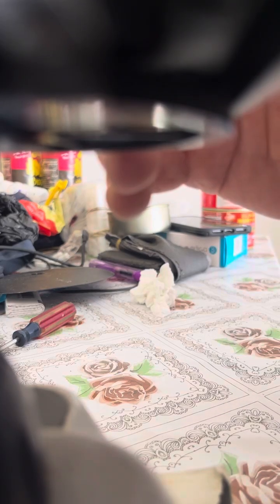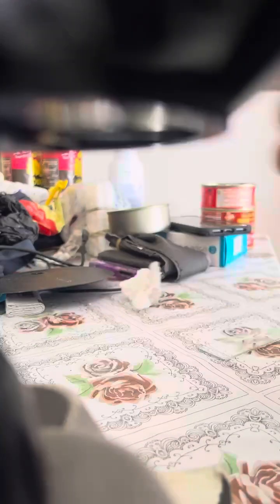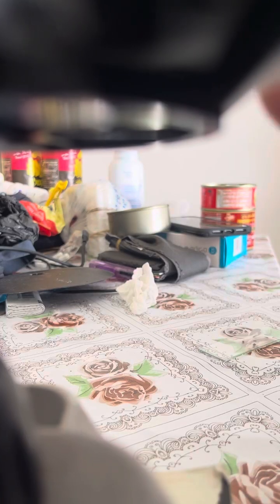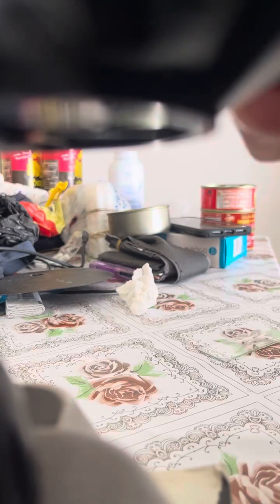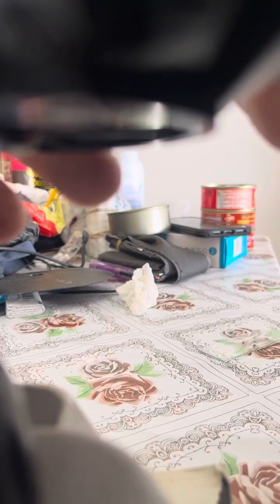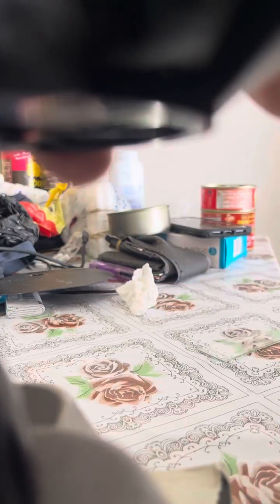So let's just dismantle the right hand, and we'll just work with the left hand for now, just to continue this examination. It will not be that comfortable, but I cannot fix it now, and it's a hassle. So let's try to work just with the left hand of the microscope, of the table.